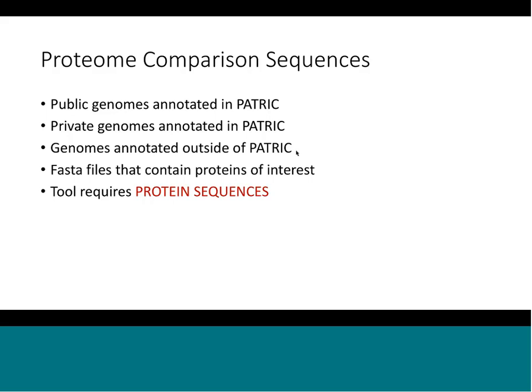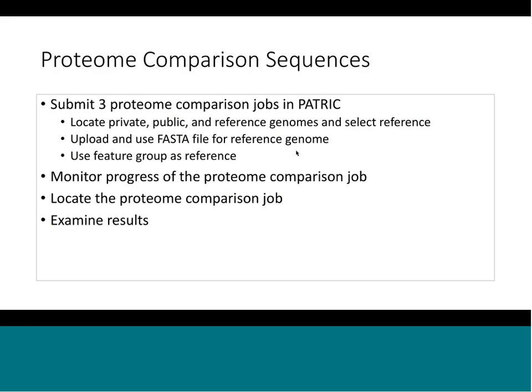Let me point out yet again that the tool requires protein sequences. Occasionally people will come and give me a FASTA sequence that's nucleotide. The tool won't work with that, so don't do that.